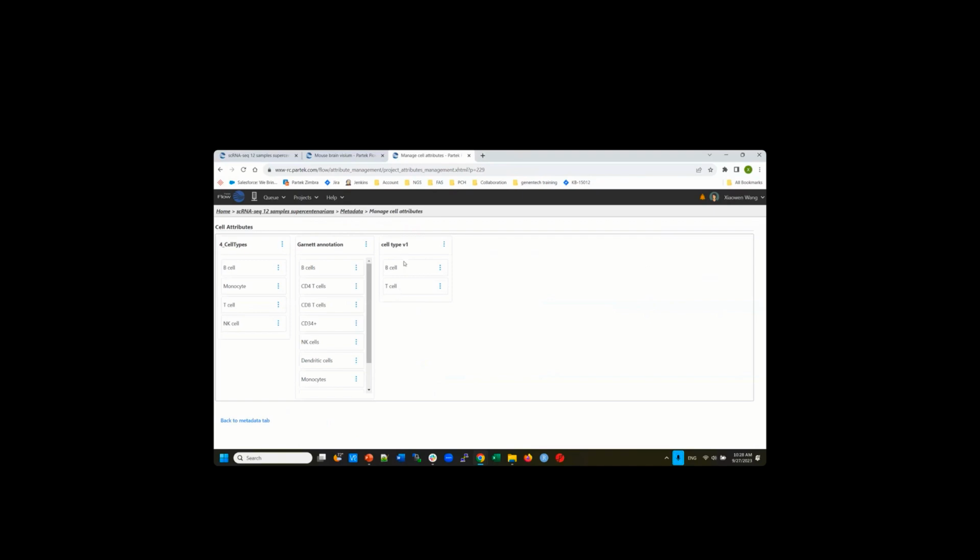So you don't want to classify half of your data, apply that, and then the other half of your cell types are going to be NA. And you're going to have a hard time merging two columns. So this is only one column, and for each barcode you have the cell type. You give the assignment to it. And previously, I already had the 4 cell types classified.